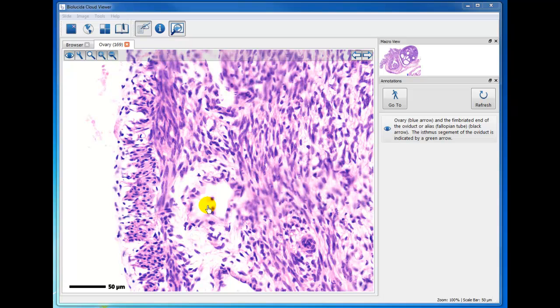So just before we go and look at the epithelium, on the outside of the isthmus of the oviduct are simple squamous cells, and this is the serosa with some connective tissue underneath it. But those are simple squamous epithelial cells, and they form the mesothelium, which is part of the peritoneum. And within that you've got a layer of smooth muscle cells that are running longitudinal, another layer that's circular, so you see longitudinal sections through smooth muscle cells.